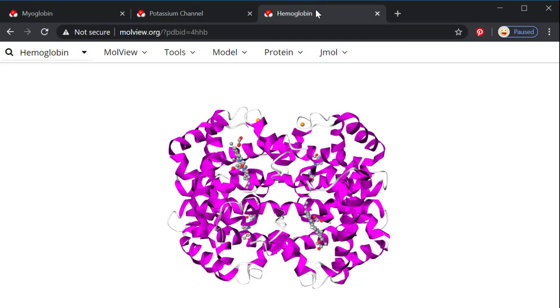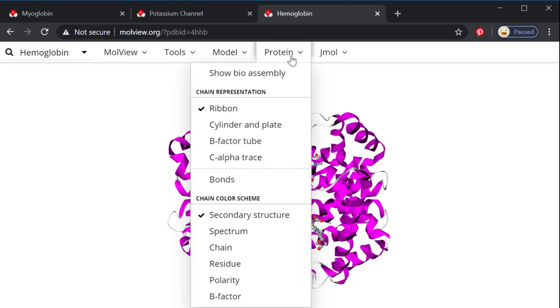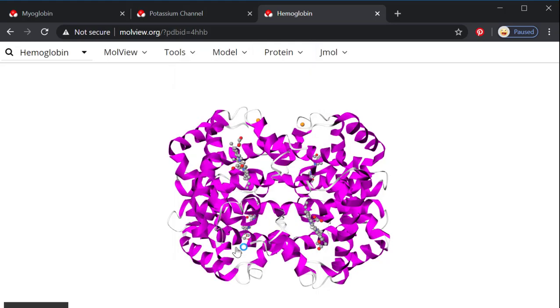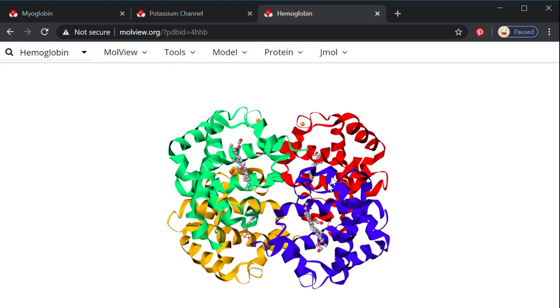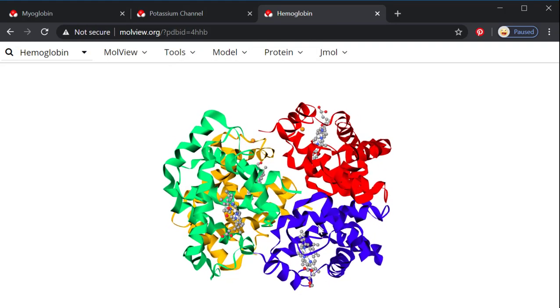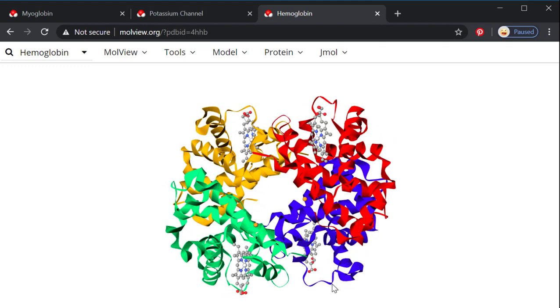Here's hemoglobin, which is related to myoglobin, but larger. You can see it's only got the alpha helices in it. And if I draw it with this chain, then I can see that there are not one, not two, but four total different polypeptides in the quaternary structure here.